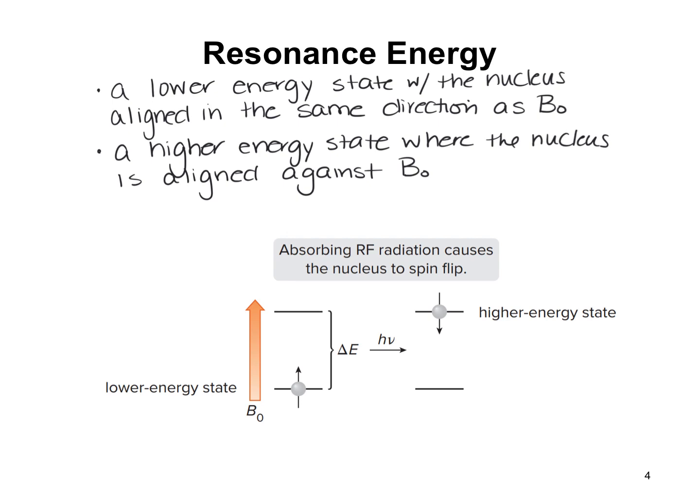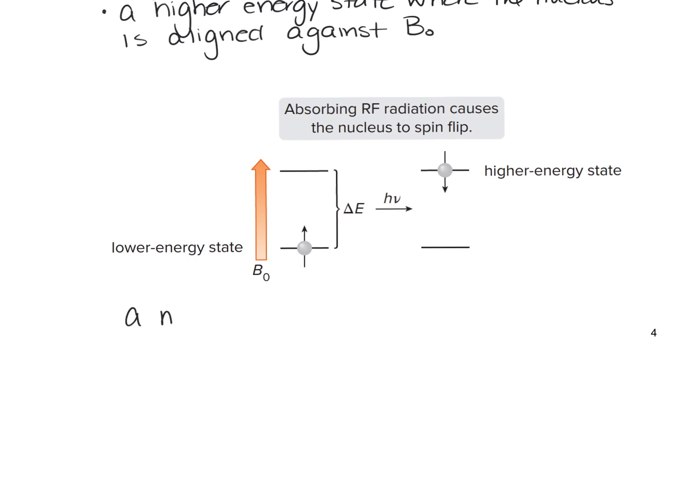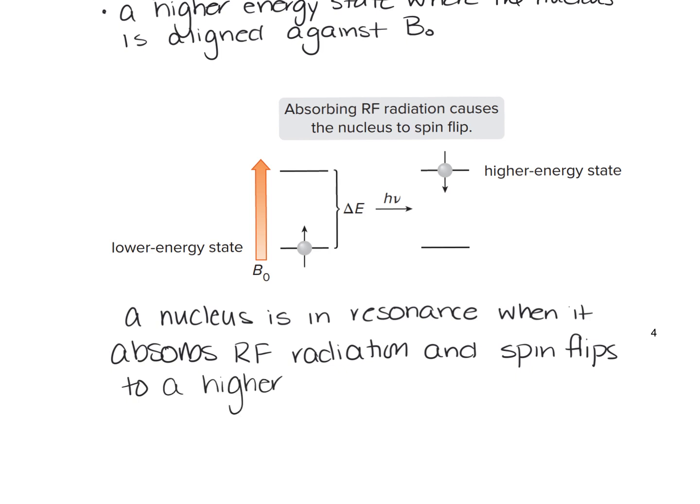Now, we say that a nucleus is in resonance when it absorbs radio frequency radiation and spin flips to a higher energy state.